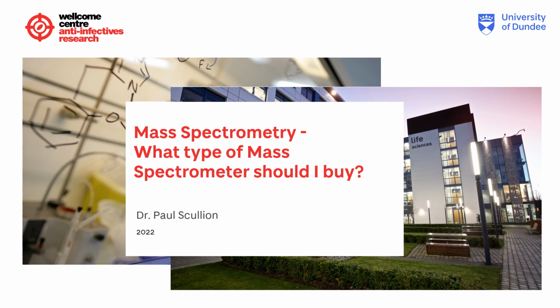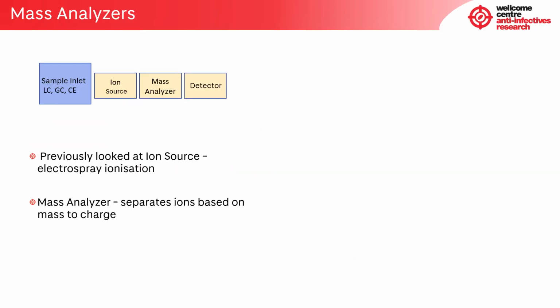In this talk, we'll look at the different types of mass spectrometer and what applications they can be used for in medicinal chemistry and bioanalysis. In particular, we'll concentrate on the different mass analyzers that are available.